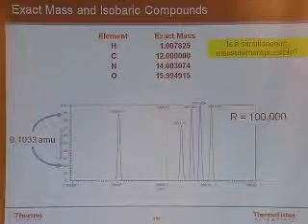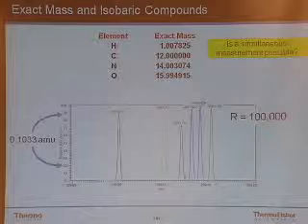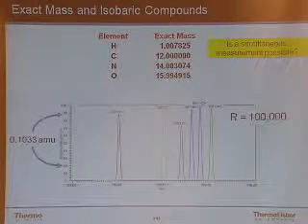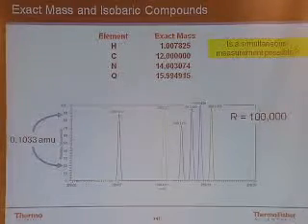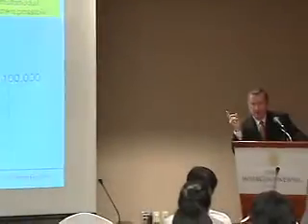And when you look this up in the Merck Index, you'll find only 1 compound in the world with that molecular weight. Now, when I come back to Korea in the spring, I fully expect to come back with a software package that allows you to search the whole Merck Index for all organic compounds. Because now we're looking at total unknowns, and that's why you need the Merck Index, also because the Merck Index reports their molecular weights out to the same degree of accuracy. So we think that that will be a major new search tool.